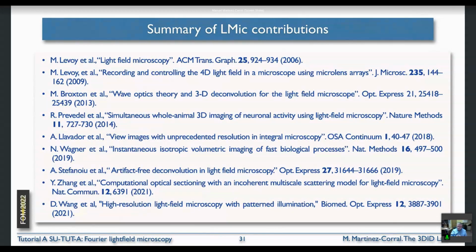Even currently, there are many groups still working with the conventional light field microscopy, the one reported in 2006. They are reporting very nice results, which are published in very nice journals.